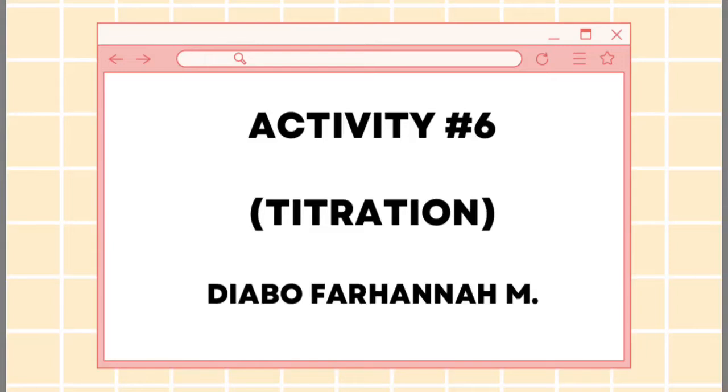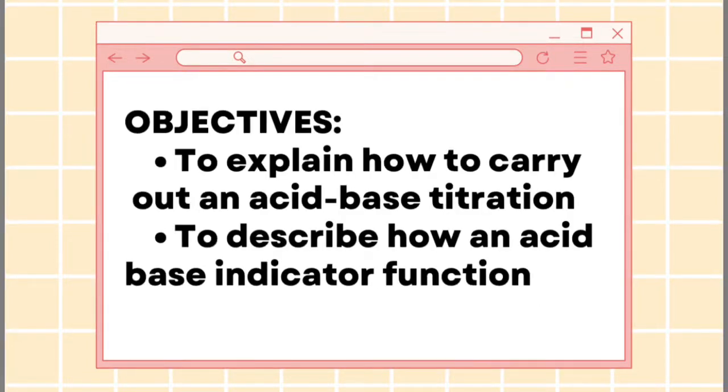Good day everyone, I am Jabo Farhana and I will be discussing what is titration. My objective is to explain how to carry out an acid-base titration and to describe how an acid-base indicator functions.